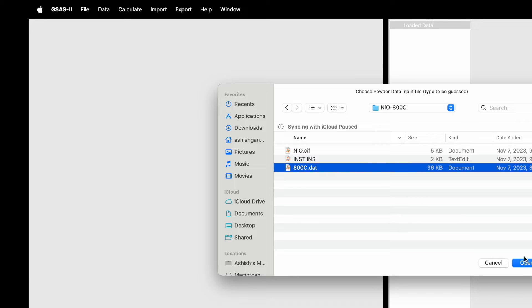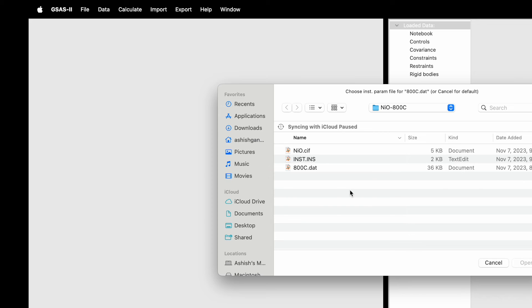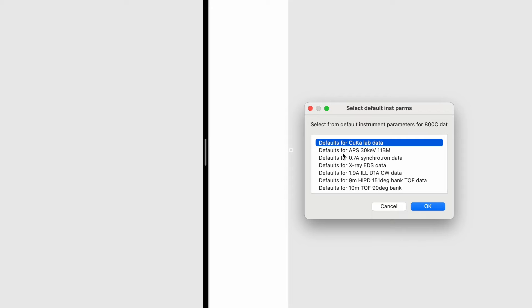Click on the data file, open it, say yes. Now it will ask you to choose an instrument parameter file for 800C. As I said, I don't want to use this one, so just click cancel. It will give a 'select default instrument parameter' — default for copper Kα or default for APS. In this case I used a Bruker instrument, so I know I have used copper Kα data. So I will select default for copper Kα lab data and click OK.